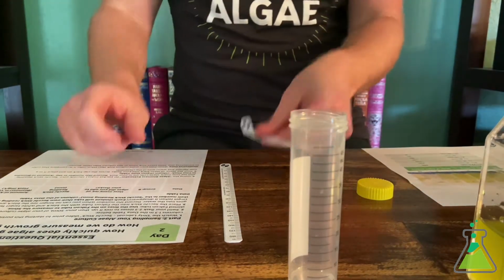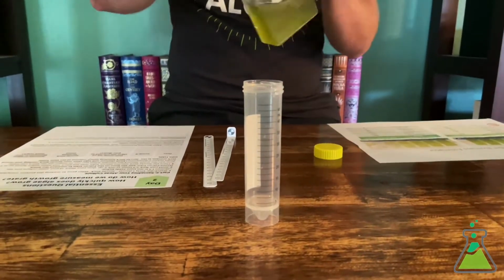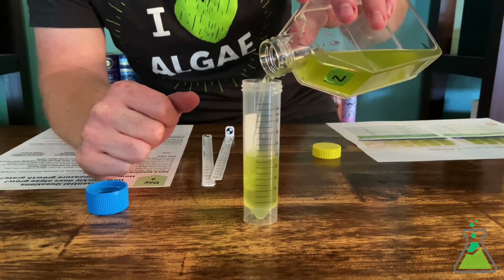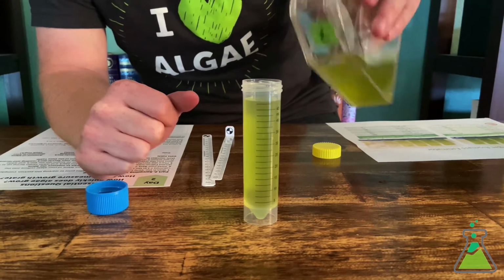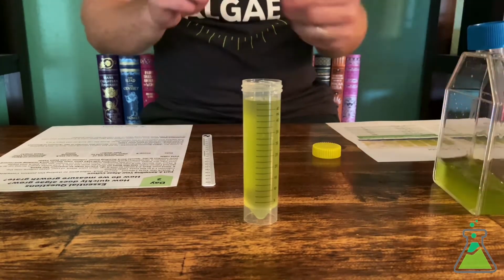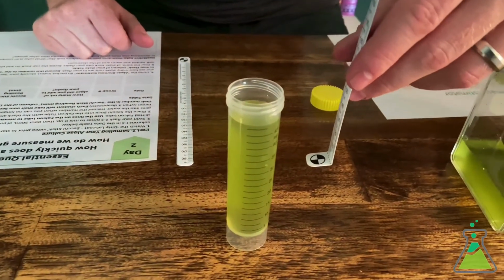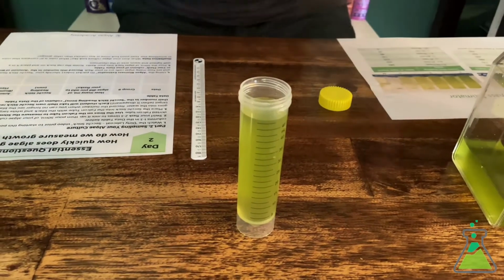All right, so let's do this for real then. So we're going to go ahead and make sure our algae is nice and mixed up. And we're going to fill our falcon tube up with 50 milliliters of our culture. Perfect. All right. So we're going to go ahead and use the Secchi stick. And remember, we're going to lower it vertically through the culture until we can't see the shield anymore. And then we're going to write down exactly where the water surface is touching the ruler on the Secchi stick.